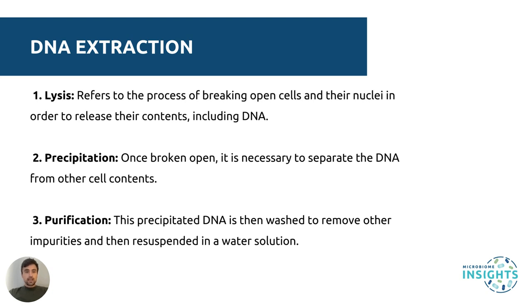The next is precipitation. Once the cells are lysed, the DNA must be separated from other cellular materials. This step is vital to isolate the DNA for further processing. Finally, there's purification. The DNA is then washed to remove any impurities, leaving behind clean, high-quality DNA that can be resuspended in a water solution for analysis. Each of these steps must be done with care to avoid degrading the DNA or introducing contaminants. Many commercial kits are available for you to optimize the DNA extraction from your particular sample type.